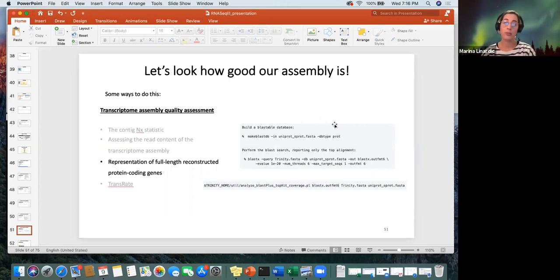And in BLAST Online, practically what you do is you have a sequence and you're interested in whether any of the online available databases have your sequence, or how similar your sequence is to those that are available. But if you have a database that is yours, let's say you have your genome or some RNA-seq sequences that you want to use as your database, and you want to blast something else against the database.